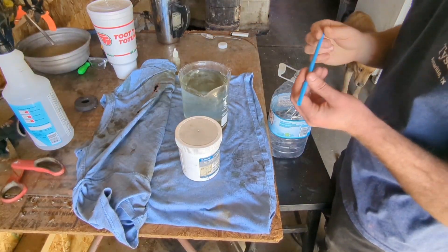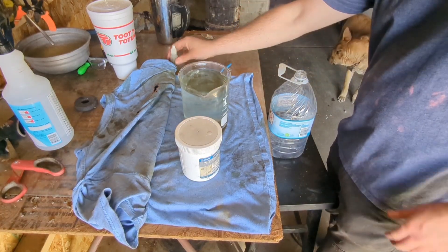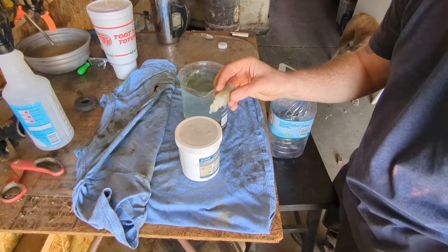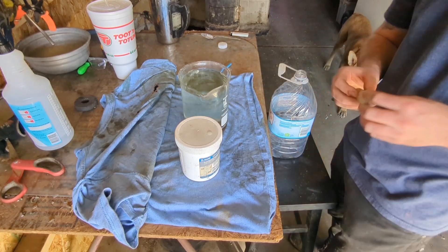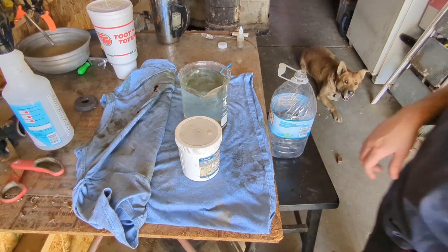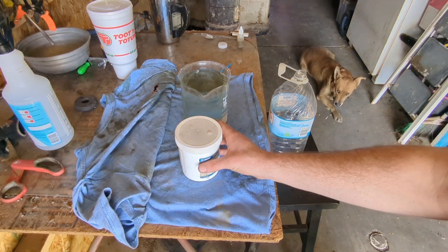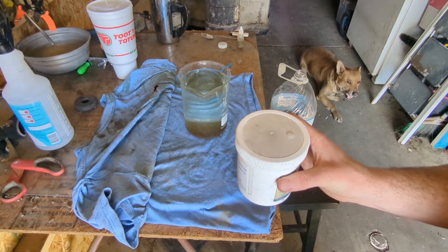Before we do that, we'll do a quick Stannous Chloride test to make sure we don't have any gold still in our solution — make sure it's all precipitated out. You can see there's no change in color on that, so we're good to go.